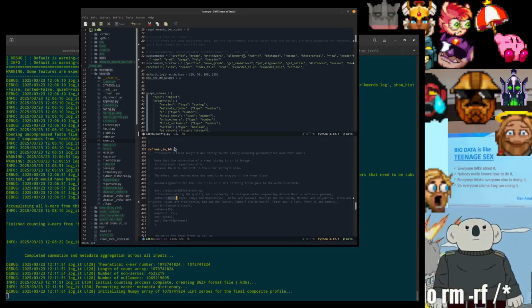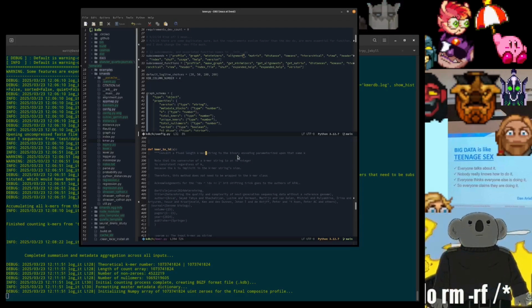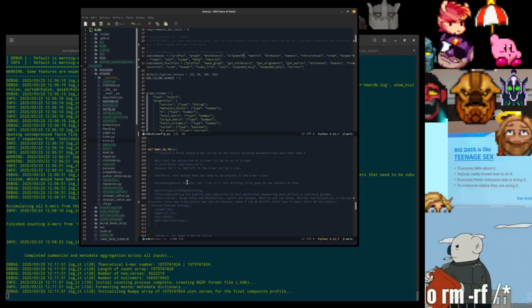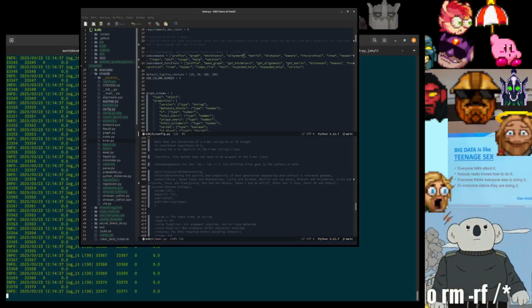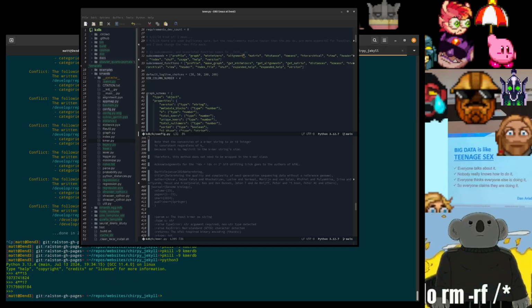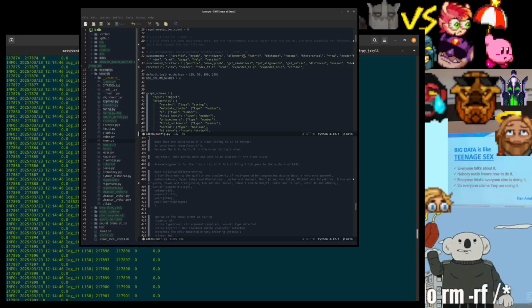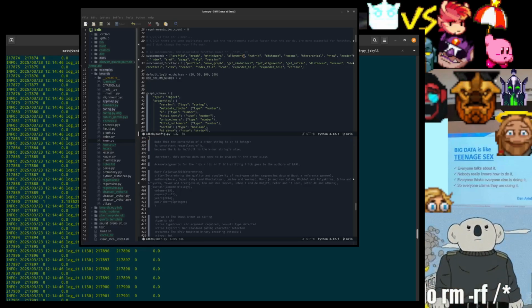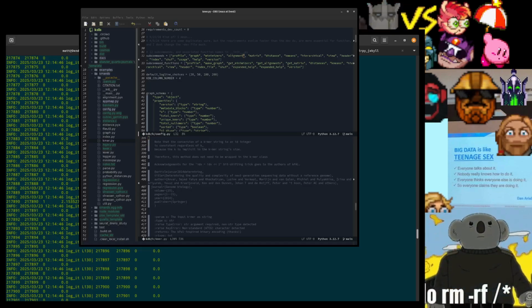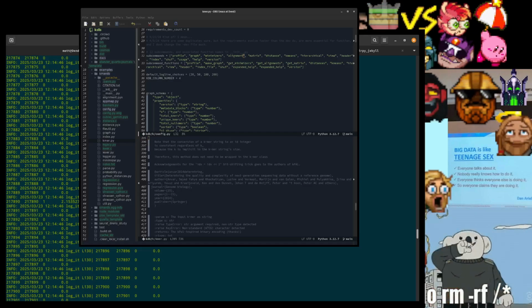But what this function does is it takes some string, a kmer, and converts it into the quote-unquote binary encoding using the bit shifting trick. Here we go. So here is a kmer. This is the 217,890th kmer.